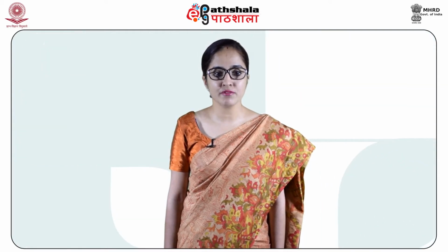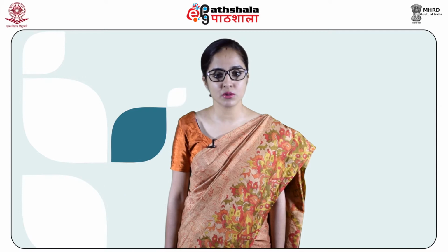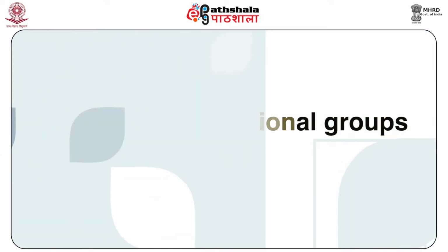It is employed in forensic analysis in civil and criminal analysis also. IR spectroscopy is used in dynamic measurement, quality control and monitoring applications. Some examples are the long-term unattended measurement of CO2 concentrations in greenhouses and growth chambers by infrared analyzers. Now we will begin with the detection of functional groups, which is important for an organic chemist.